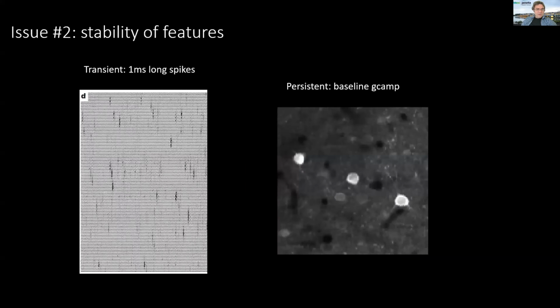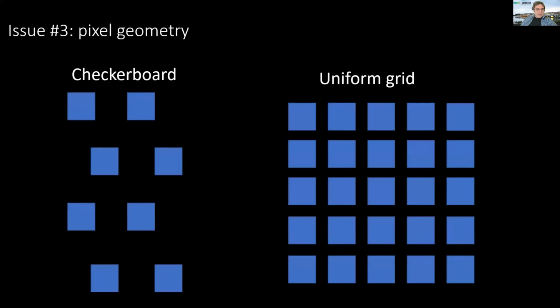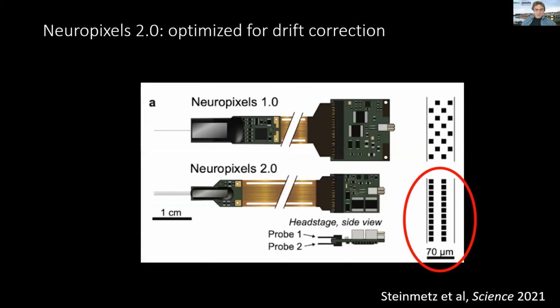And we took that and improved it to a point that it was working very well. I'm going to go over some issues of making this comparison with calcium imaging. Yes, it's still registration, but there were some unique issues we had to solve, and then we did.